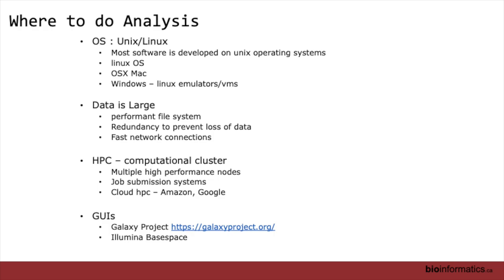And I mentioned as well, there's some graphic interfaces for working with this type of data and running this type of analysis. I mentioned the Galaxy project, which you can take a look at. They have a lot of click and picking things and doing things to run your analysis. It's good for playing around with the data. It's good for analysis as well, depending on what you're doing, if you're working with smaller genomes, especially.